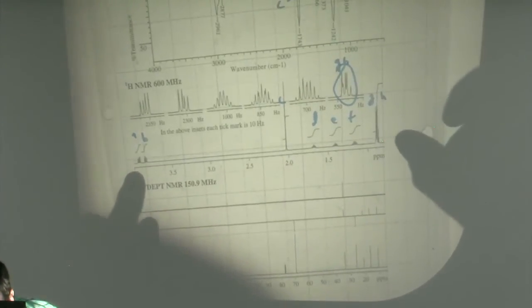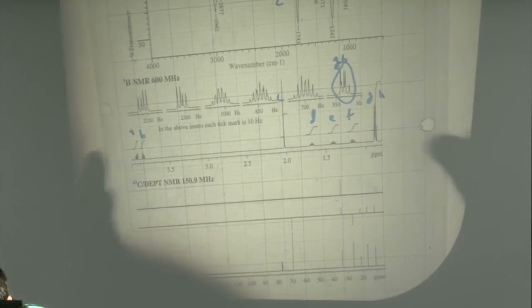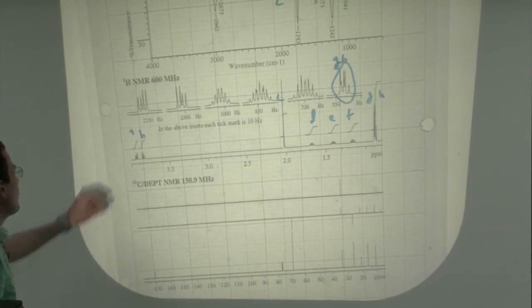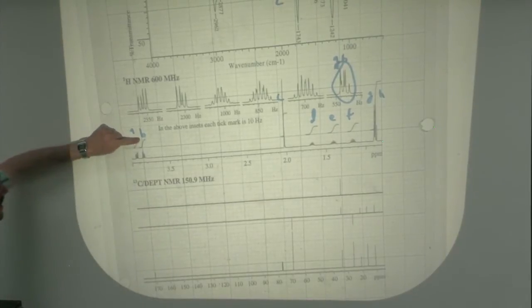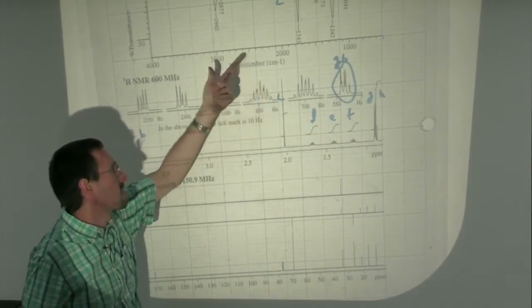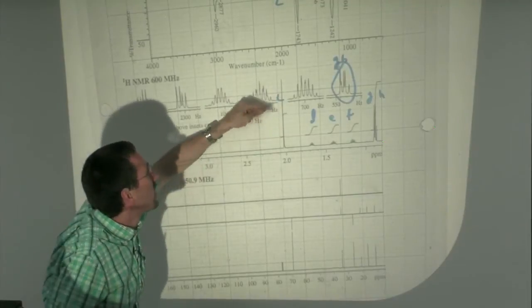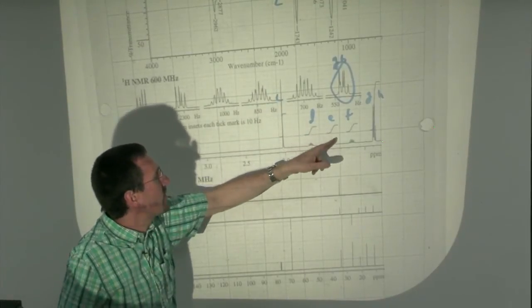If I'm really feeling lazy, I could even use my grid as a sort of uber ruler, and say, oh, 1.7, 1.7, 5, looks like about 5.3, 5.4, yeah, 5.4, 1.7 or 1.8.